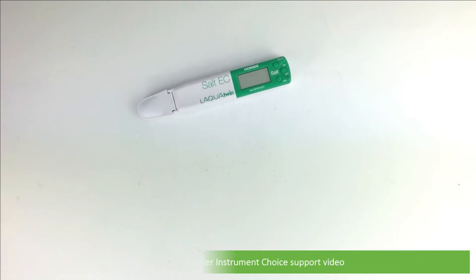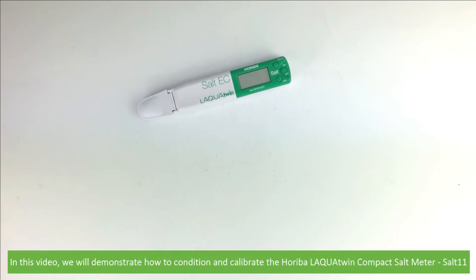Hi and welcome to another Instrument Choice support video. In this video, we'll demonstrate how to condition and calibrate the Horiba Lakwa Twin Compact Salt Meter, the Salt 11.